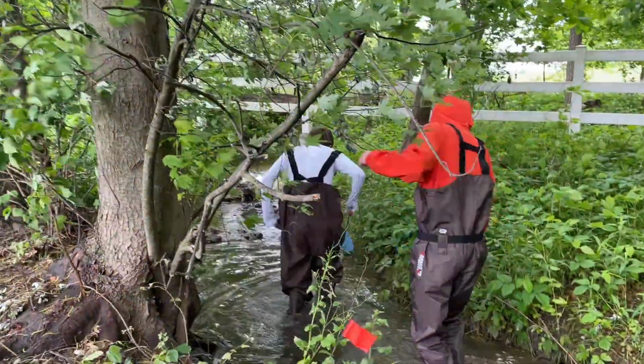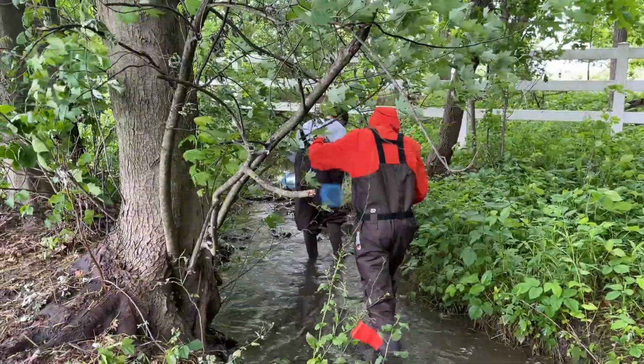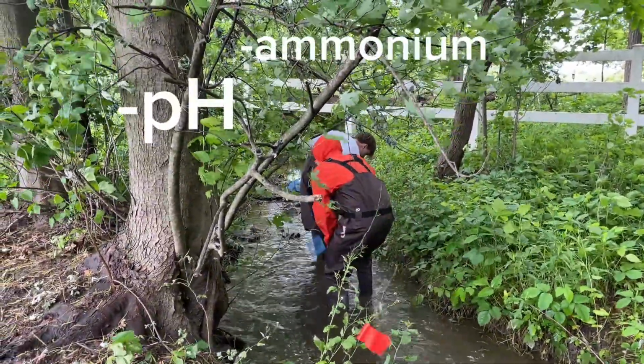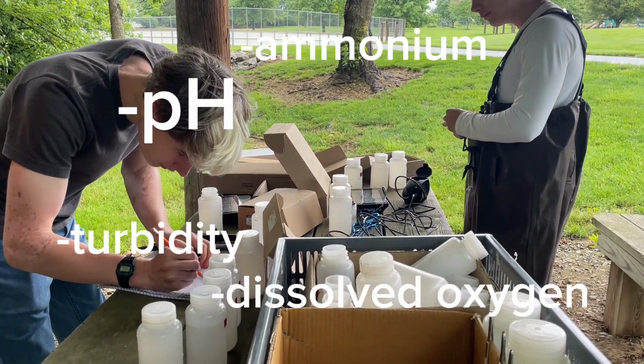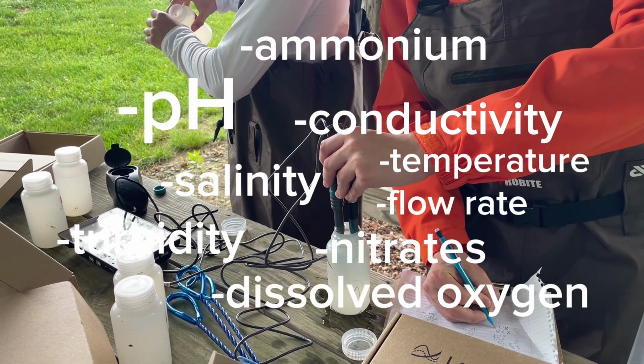So let me break it down for you. Our watershed is home to numerous variables that are actively affecting each other. The ones we test for are pH, ammonium, dissolved oxygen, turbidity, conductivity, salinity, nitrates, temp, and flow rate.